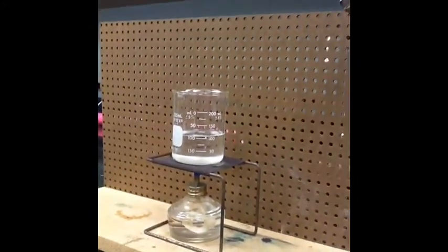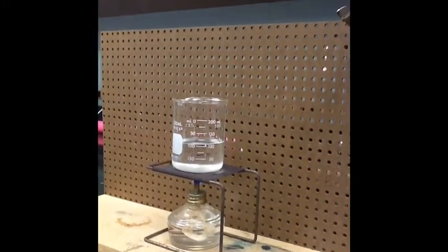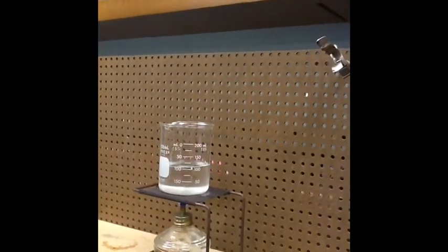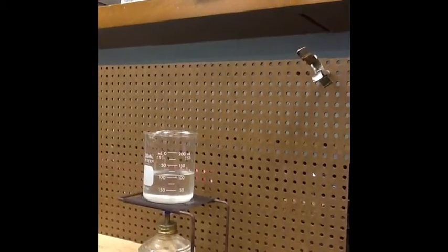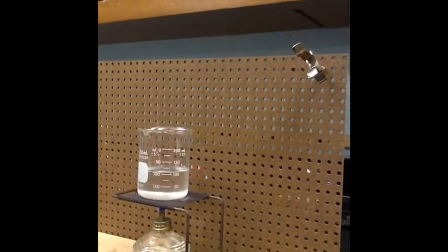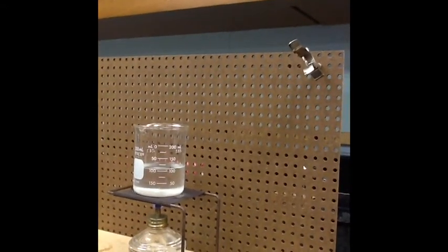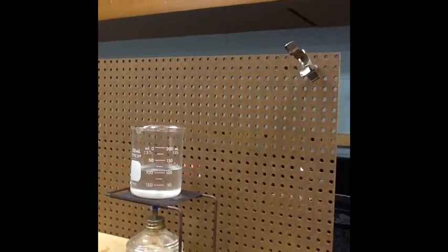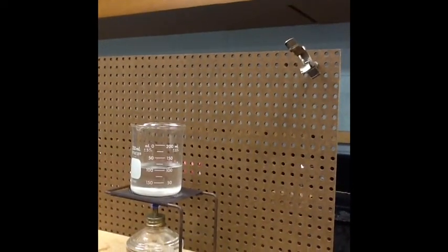We have the alcohol lamp and it's now heating the beaker. What we've done is measured 100 milliliters of water from the sink, and we can put this on.